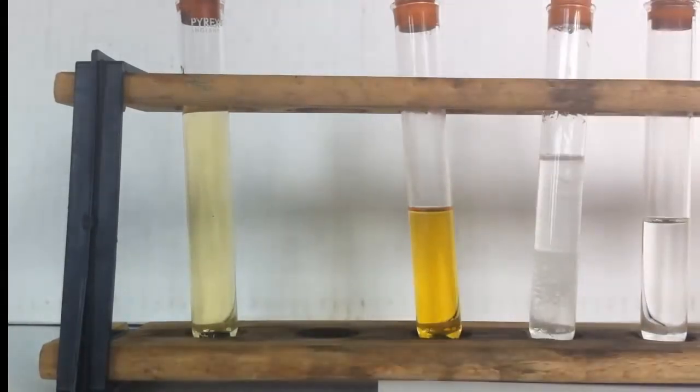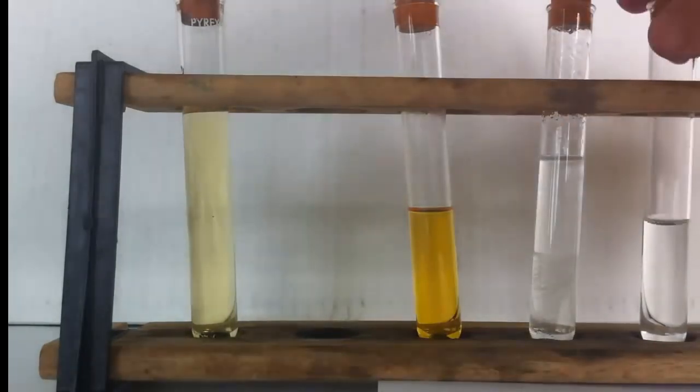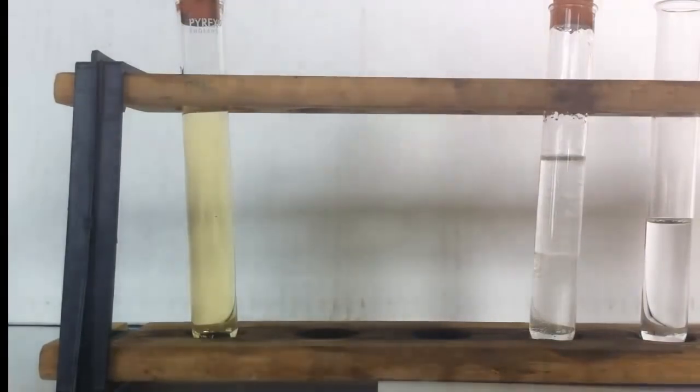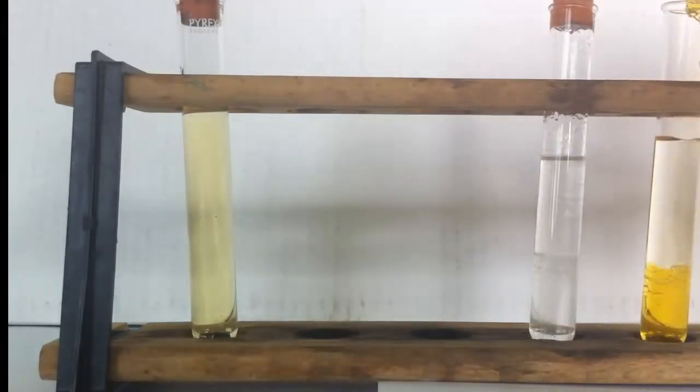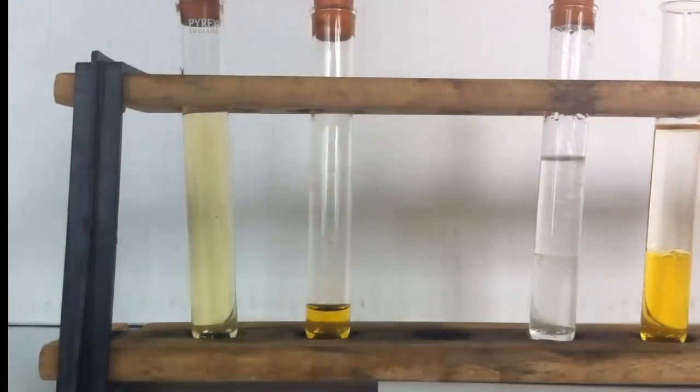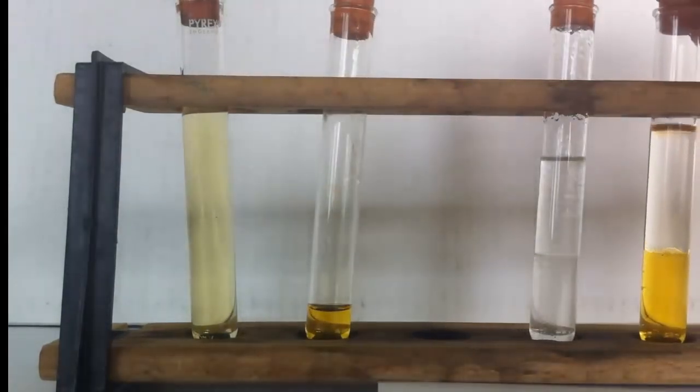Let's try that now with the cyclohexene. Here on the right. So again I'll add roughly the same volume of bromine water. We're expecting a negative result this time. We're expecting the color of the bromine water to persist, to remain.